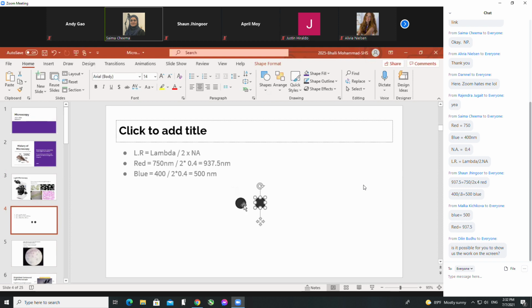Okay, if you have a poor microscope, it's going to just show you an oval. All right, so as if these 2 objects were merged together. Okay, these 2 points were merged together. If you were to use blue light, okay, what it's saying to you is that they can be a certain distance apart, okay, so that you can distinguish them as 2 separate entities.